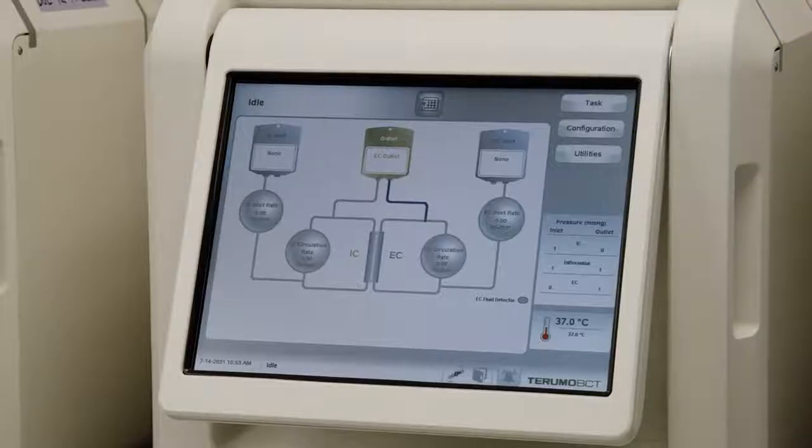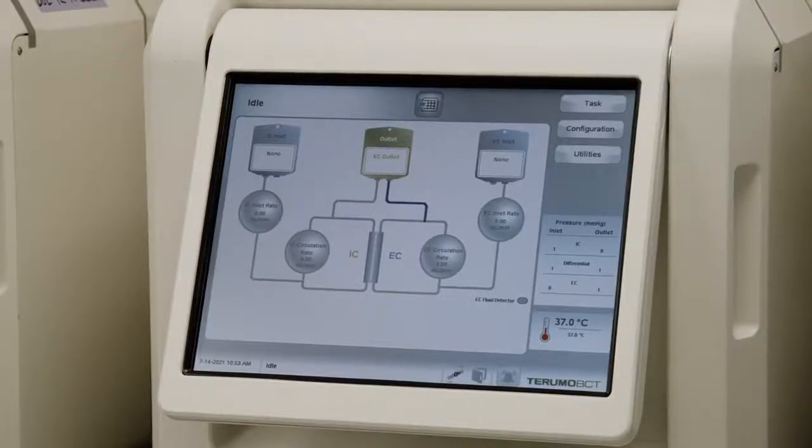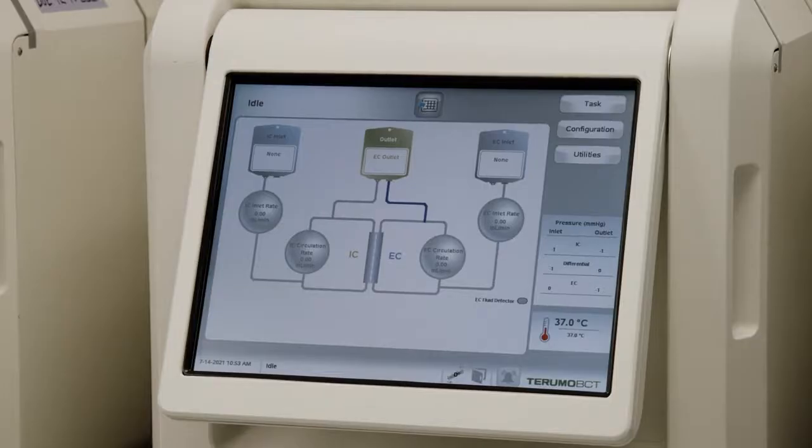Quantum's flexibility allows you to configure most of your settings to suit your process. The Quantum set we'll review today is functionally closed and pre-assembled and quite easy for operators to load. Because the Quantum's a closed system, you have the potential of reducing your facility costs.